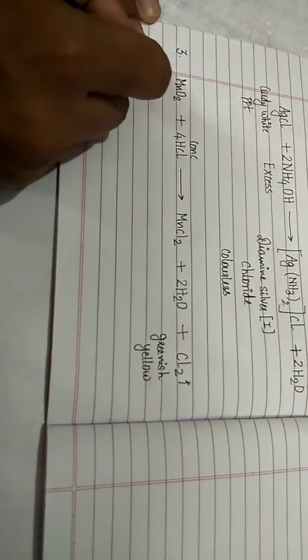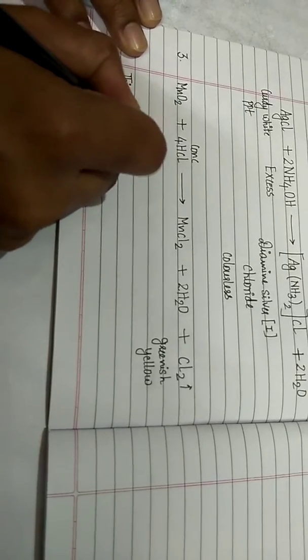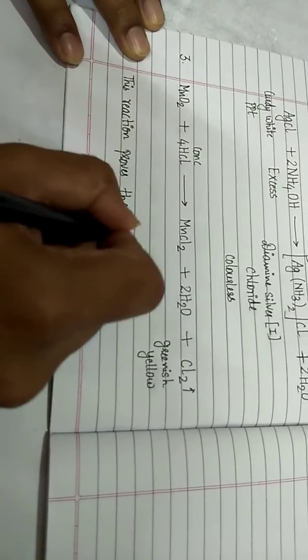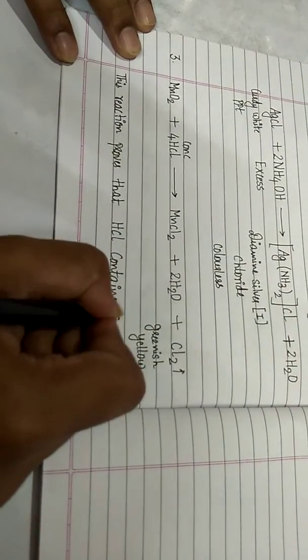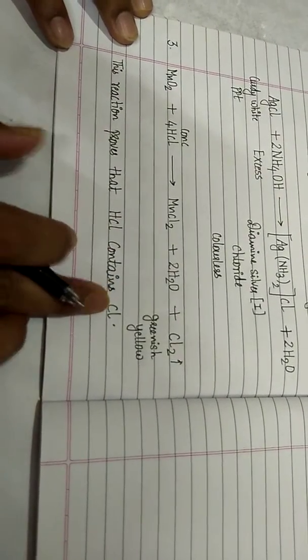So this reaction also proves that HCl contains chlorine.